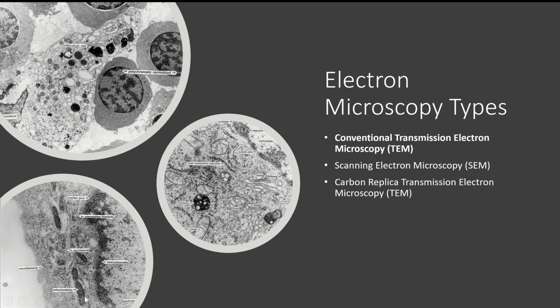So all three of these are conventional transmission electron microscopy, and it is very 2D. It's very flat. It's not 3D or anything. There aren't very many textures.